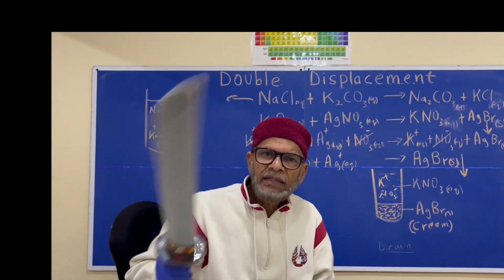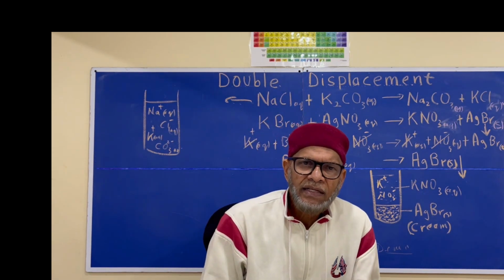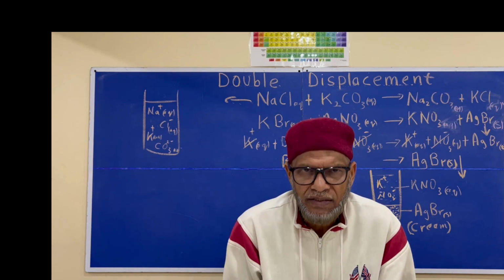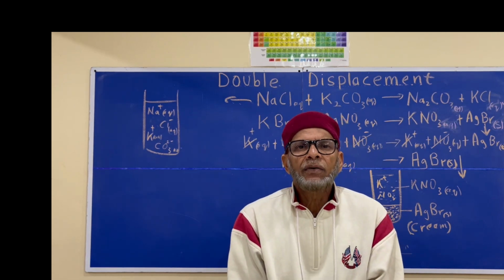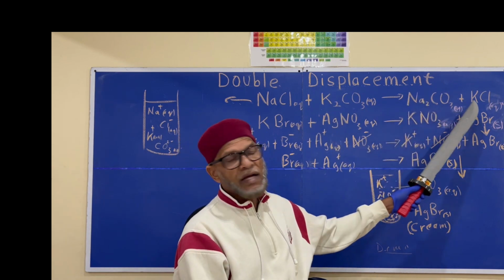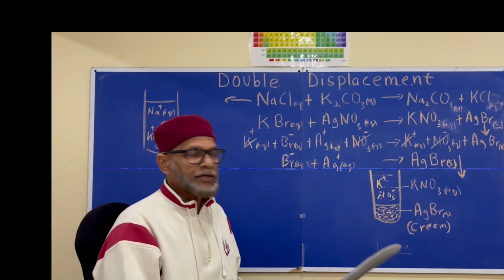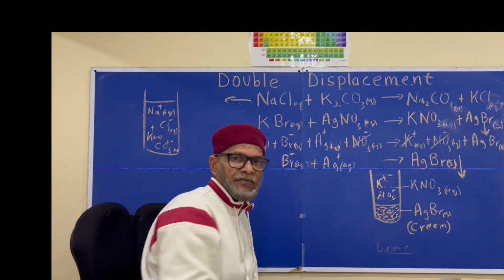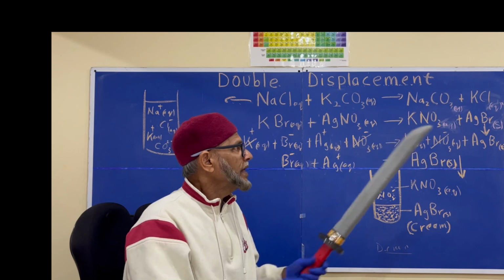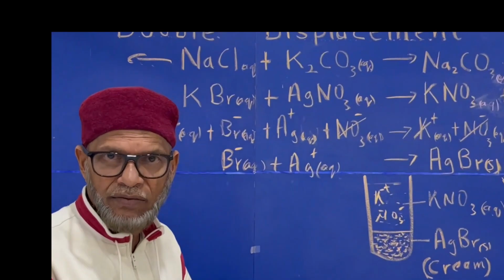In the following activity, we will mix 5 different sets of solutions, of course, with different compounds dissolved inside. The first thing we will do is write in the equation for the reaction. Secondly, we will use the solubility chart to find the solubilities of these. If both of them are soluble in water, we then write in the subscript here, AQ, to show, and therefore no reaction will take place.